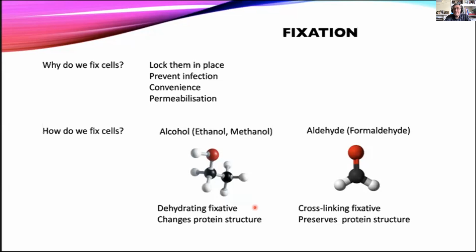And remember, many of our fluorochromes are protein-based. I mentioned PE because we're using it. APC, allophycocyanin, PerCP, these are also protein dyes, and all of their tandems are also protein dyes, and they may well be affected by ethanol fixation. So we have to decide, is that what we want to do? And if we don't, then we would generally use a formaldehyde fixation.